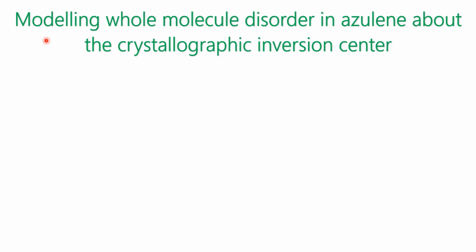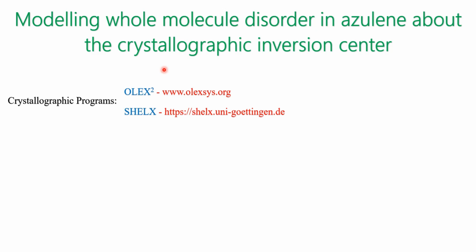I welcome you all to this video tutorial on modeling whole molecule disorder in azulene about the crystallographic inversion center. The crystallographic programs used are SHELXT and SHELXL. These programs are available free of charge for academic users.